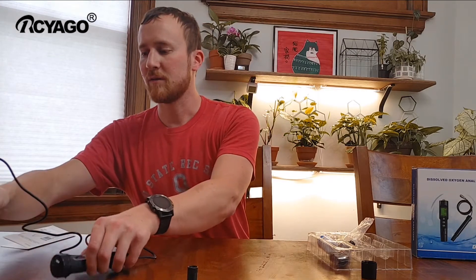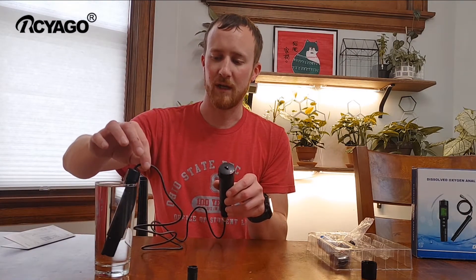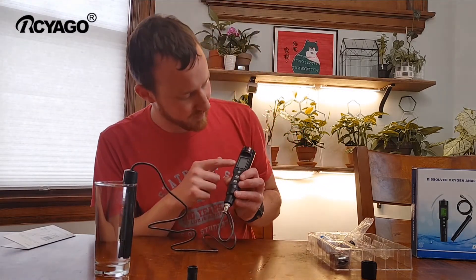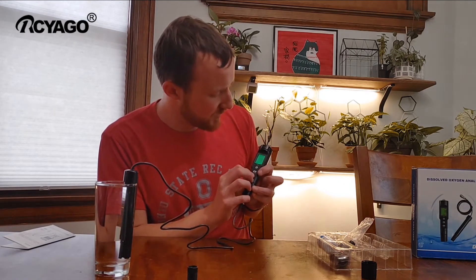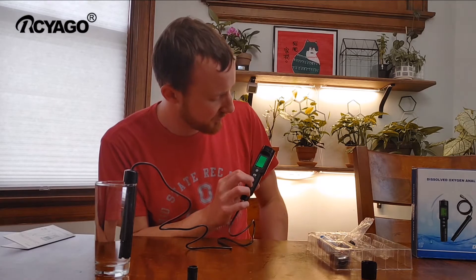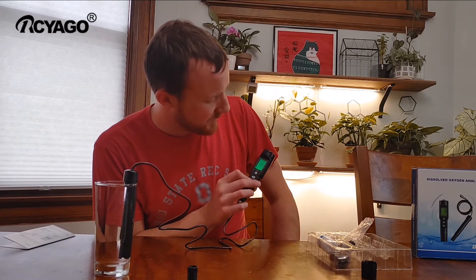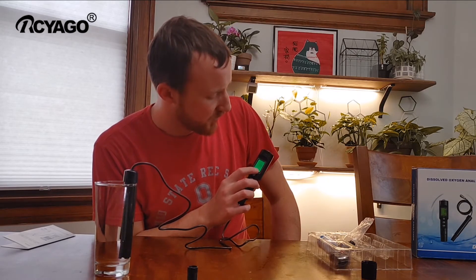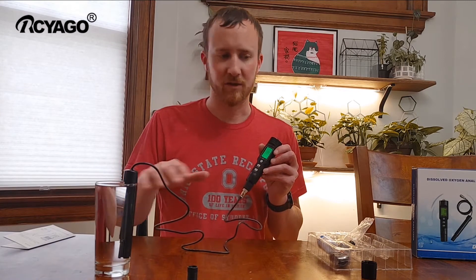I have it over here right now and it's sitting because it takes a little bit to measure the temperature. Right now, with just tap water, it's sitting at about 7.6 milligrams per liter. I can change modes — it's showing 8.4, 8.0 milligrams per liter, 8.4 — so it hasn't stabilized yet. It's been sitting for a couple minutes; it does take some time, and that will tell you the amount of oxygen in this liquid.